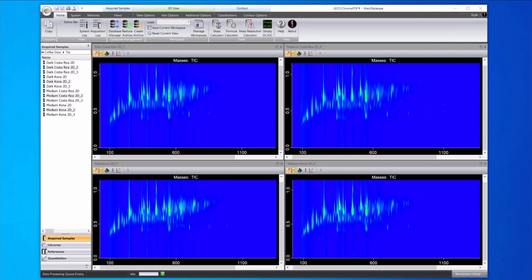Our primary goal was to explore differences related to the roast level. This type of non-targeted analysis can be challenging, especially in situations like this where the samples are complex and appear to be quite similar by visual review. For this data we also have the potential for other variation between the samples with the different geographical origins.